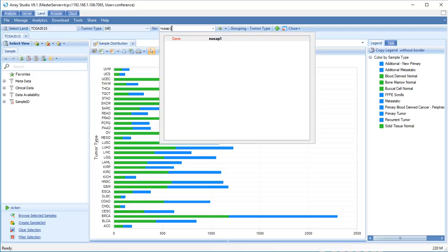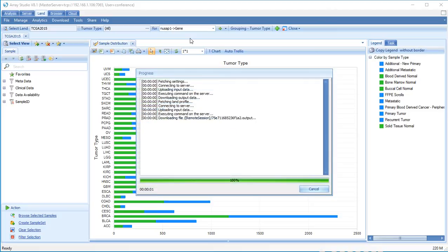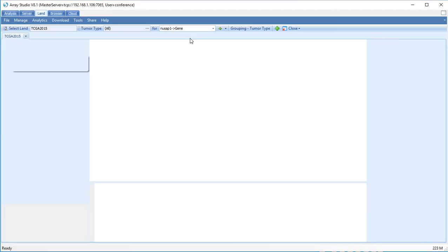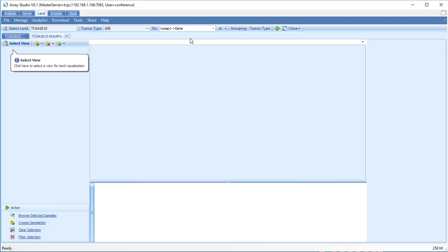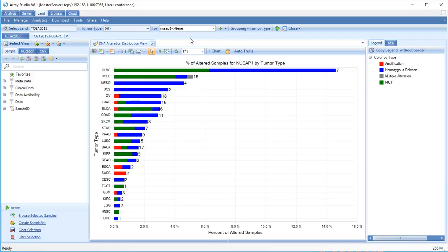The search bar dynamically displays matches to your query. The default view for gene-level data is the DNA alteration distribution view. Each sample with DNA alteration data for NUSAP1 is grouped by tumor type and subgrouped by type of alteration if an alteration was detected.